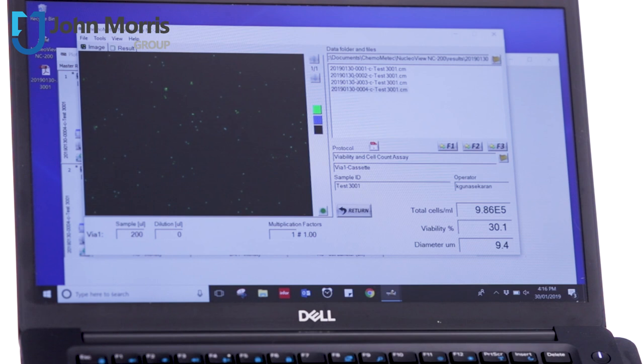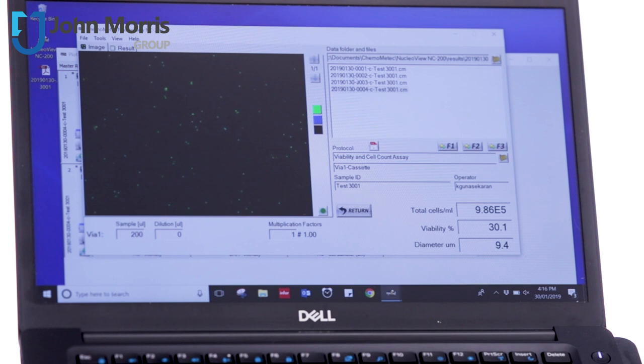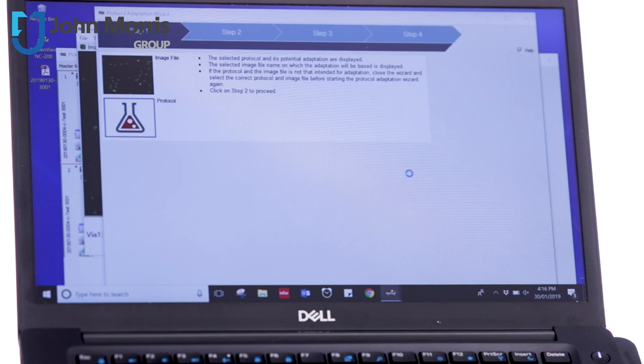Another really neat feature that you might find particularly handy is, if I right click here, a protocol wizard. And what that really enables us to do is, if you're working with the same kind of cells day in and day out, you can create gates using this wizard.